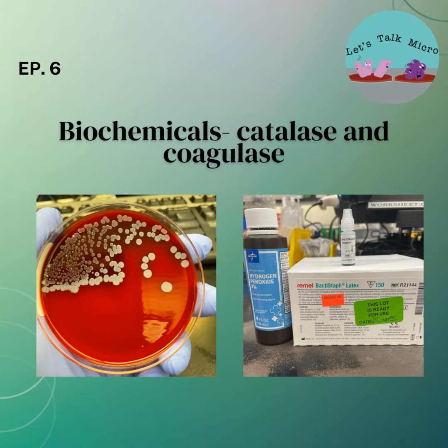So that 40X is a very helpful tool. It points you in that direction. It can make your job easier. Like I said, at the urine bench, alpha colonies, long thin rods, Lactobacillus, I'm done. White colonies, coryneform gram-positive rods, okay, skin flora, urogenital flora, I'm done. So it's a very helpful tool to have in the lab. And just remember with the 40X, your condenser and your light need to be down, as opposed to your 100X. With your 100X, condenser and light need to be up.